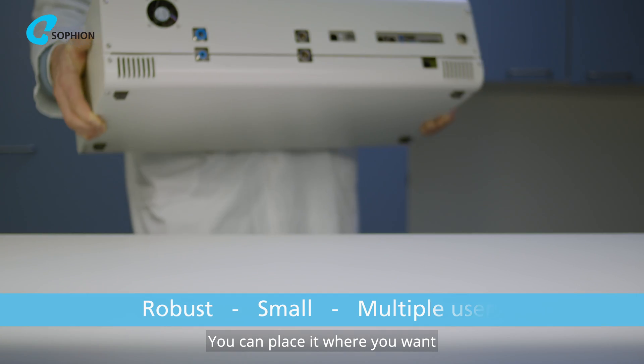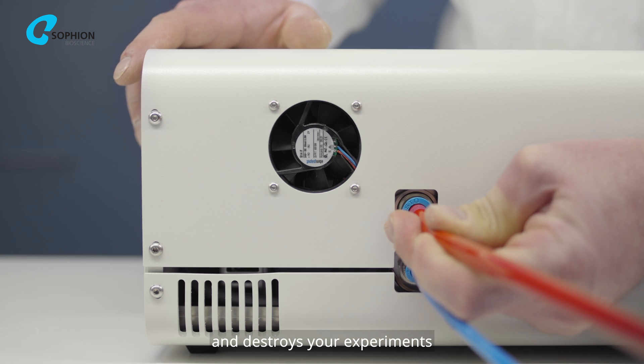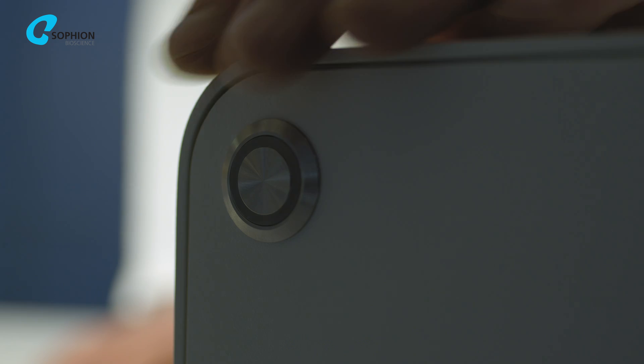You can place it where you want, though it is still so stable that you don't need to fear that anybody bumps into it and destroys your experiments. When you receive it, all you have to do is plug it in and turn it on.